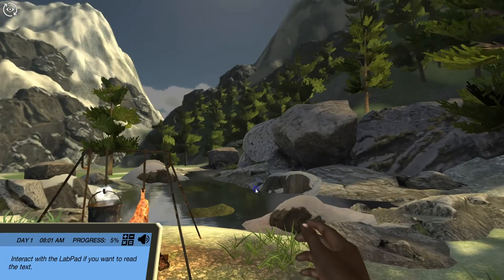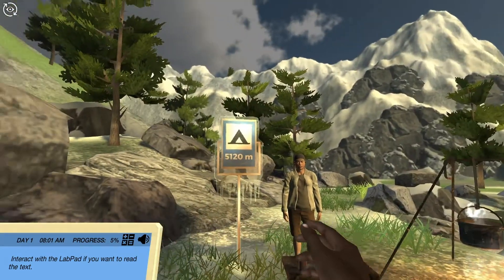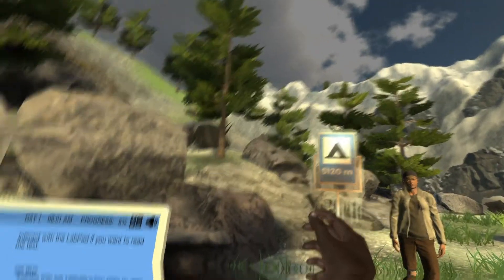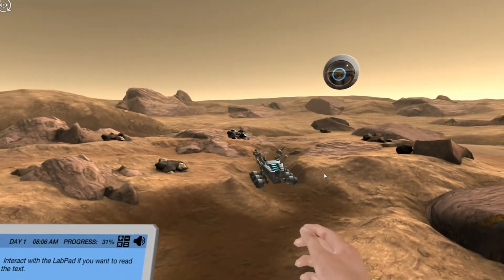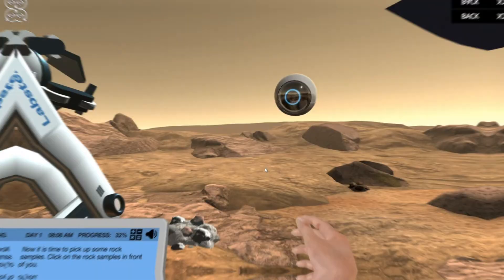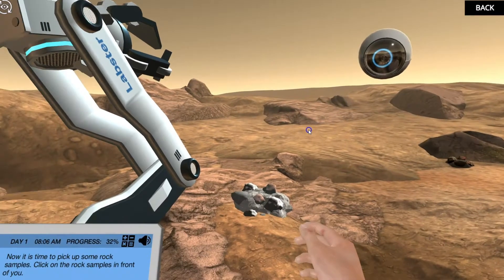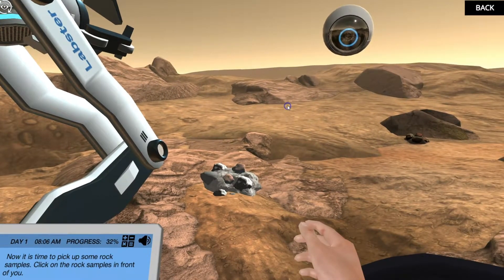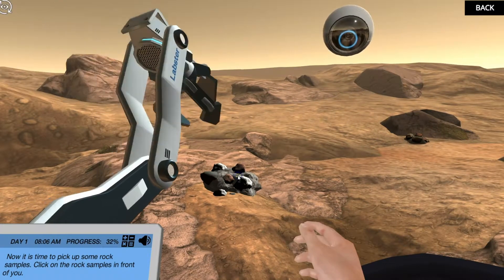Look at our beautiful small town — it's one of the highest towns on earth, however all is not well. In this hostile environment the Labster rover is on a mission to determine if this planet is or was suitable for life.